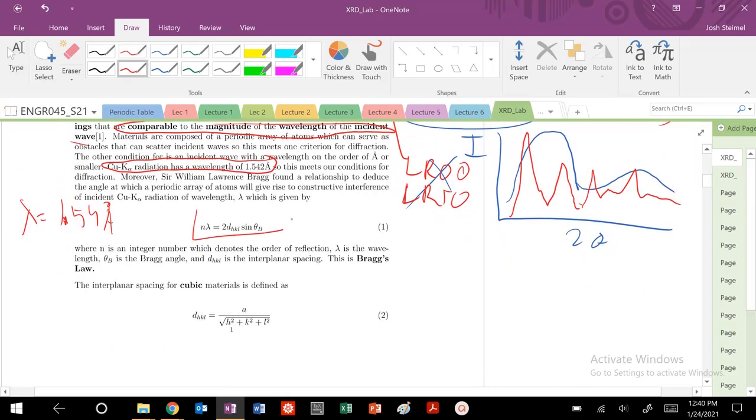So hopefully everyone remembers, and we're going to look through some slides in a bit from our X-ray diffraction, we have our Bragg's law here. And remember, the graph here is in 2 theta from our X-ray diffraction. From these angles and this wavelength, we can deduce that when we see a peak, it's going to occur at a certain 2 theta angle. And for that peak, we can figure out what the interplanar spacing is, or, more generally for polymers, just what this d is, this characteristic length.